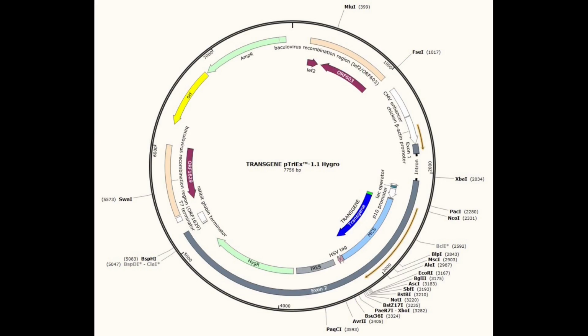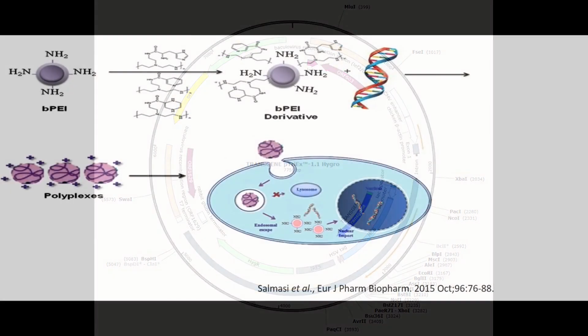The DNA to be transfected is an expression plasmid for mammalian cells with the gene encoding the recombinant protein to be produced. A secretion signal peptide is added in the N-terminus for proteins that need to be secreted to the extracellular medium. The vector contains a promoter that drives the expression of transgenes, a translational signal, the polyadenylation sequence, a prokaryotic replication origin, and a selection marker for the selection and propagation in prokaryotic hosts to replicate and isolate the plasmid in high amounts needed for the transfection.